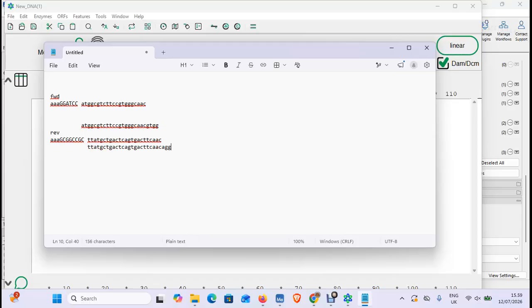And once again, yes, the devil is in the details. There's nothing to stop you using the bigger primers on a plasmid. It'll still work. And it's not like you're going to go broke for a slightly more expensive primer. But these are the options that I follow. I don't do something unless I have to, or unless there's a good reason, or it's a safety net.